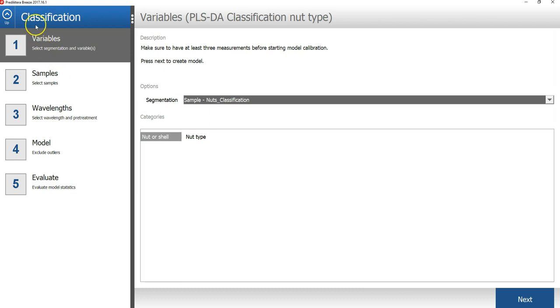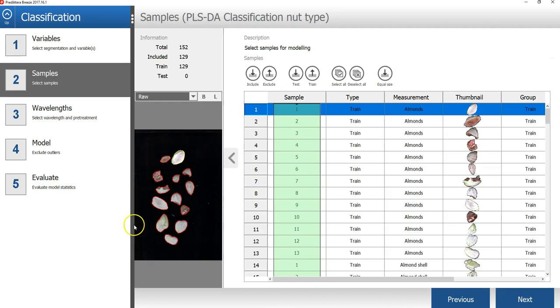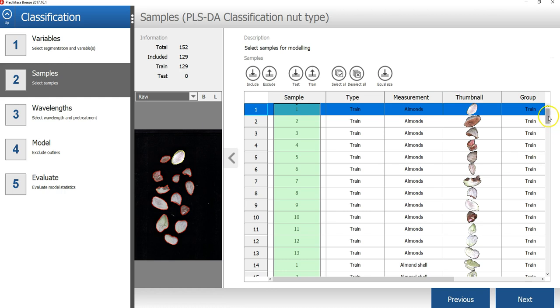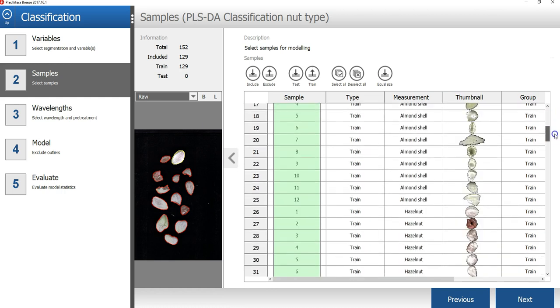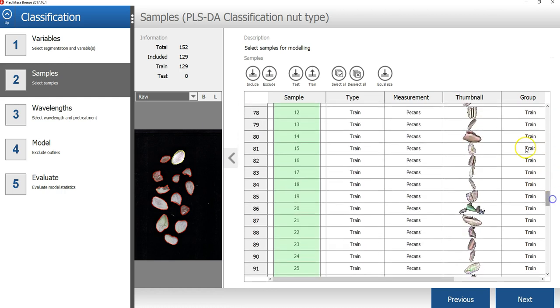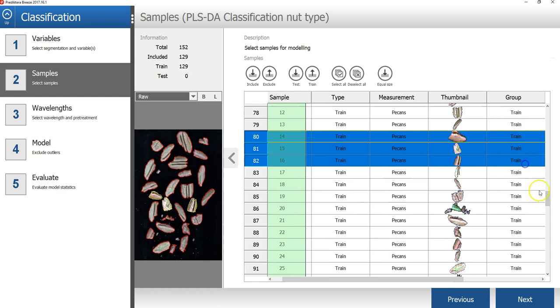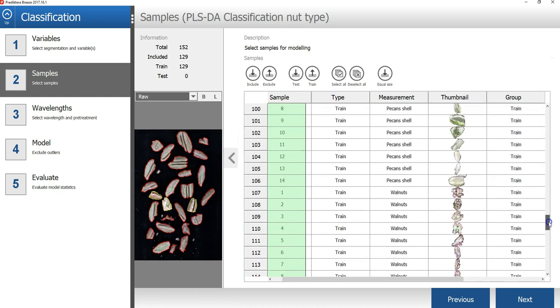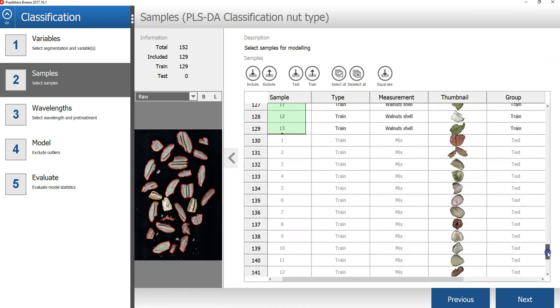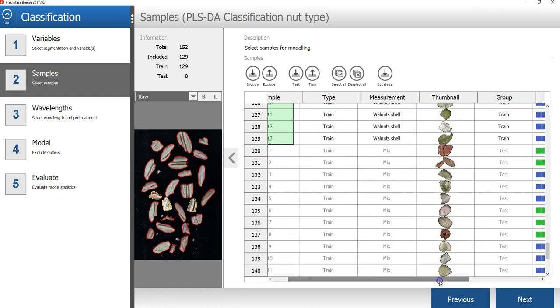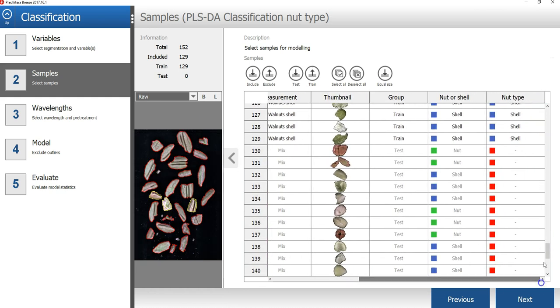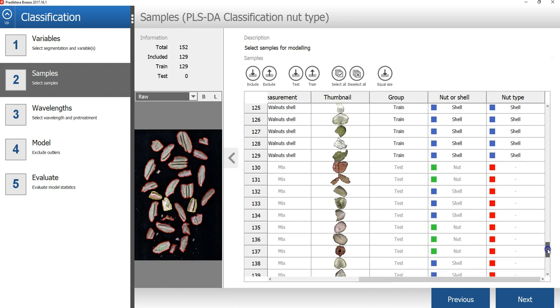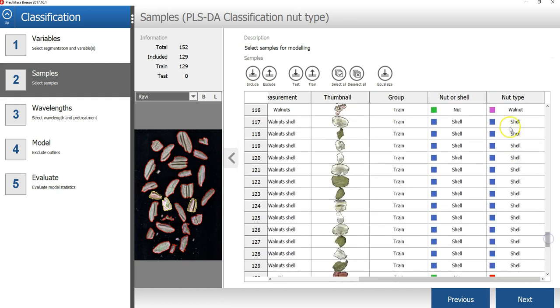In the first step of the model wizard, I will select to use the nut type variable. In the second step of the wizard, we can see that the samples that will be included to train the model are the samples that are in the train group, which are also the samples that then also had reference data for this nut type variable.